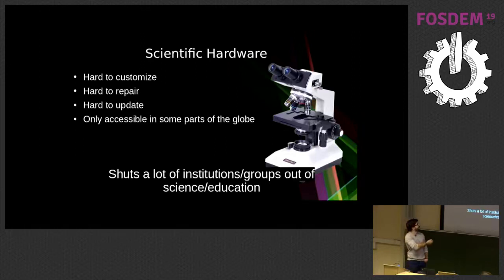Hard to get them updated. And as I said, only accessible in some parts of the globe, right? So a lot of people get shut out of this, and we have to remember that this is a tool for science and education, and therefore is basically one of the main drivers of development, right? So without one of these, for instance, you cannot do a lot of types of diagnostics, you cannot do basic research.